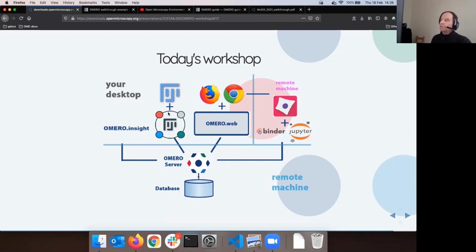And tomorrow we will explore how to connect Fiji to the Omero server using the Fiji plugin for Omero. So this is another client of Omero, if you think about it. If you put a glue software between Fiji and Omero, you can make Fiji a client of Omero, the local application which will connect through internet to the Omero server. Now, we will not go through all these softwares here, but the top right corner is again denoted with 2 blue lines, and that's for tomorrow.